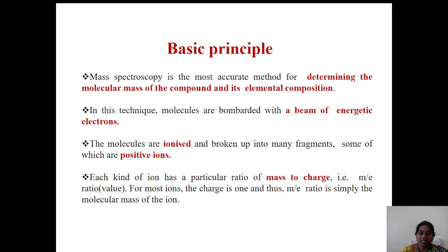in this mass spectroscopic technique, molecules are bombarded with a beam of energetic electrons. This bombardment causes the molecules to break up into many fragments, some of which are positive ions. And each ion has a particular mass to charge ratio.